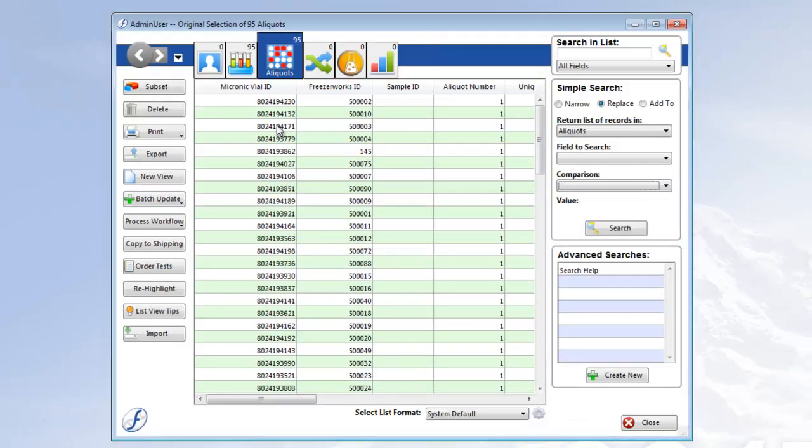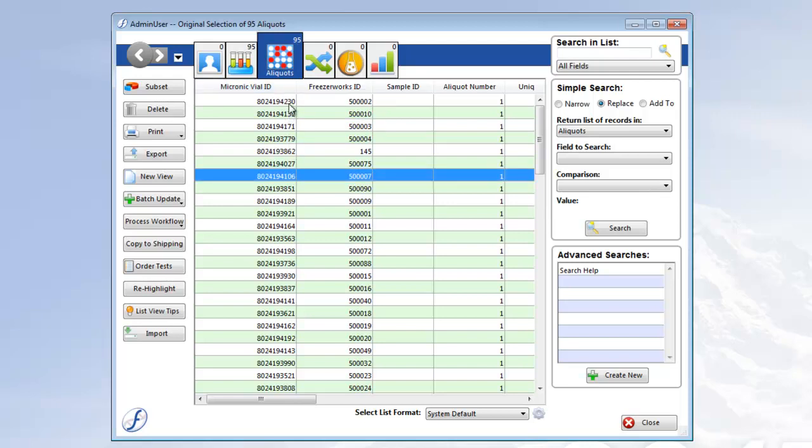And since we were searching, we're taken to the landing page list view where the aliquot records matching the scanned values are listed.